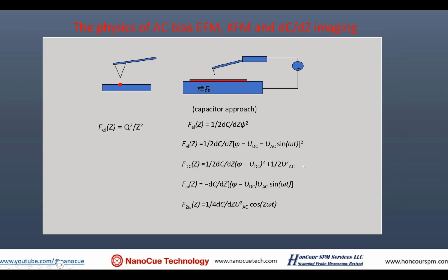Okay. There's no time here. In other words, this force does not oscillate. It's a DC force. It's very hard to detect. Then you have the second factor here.